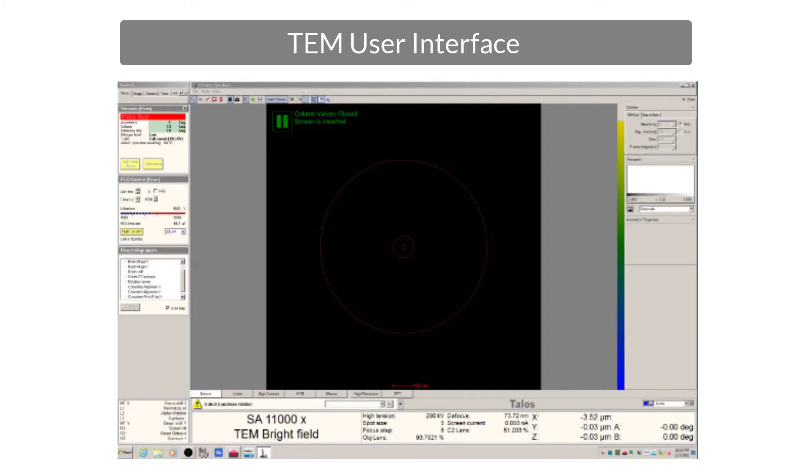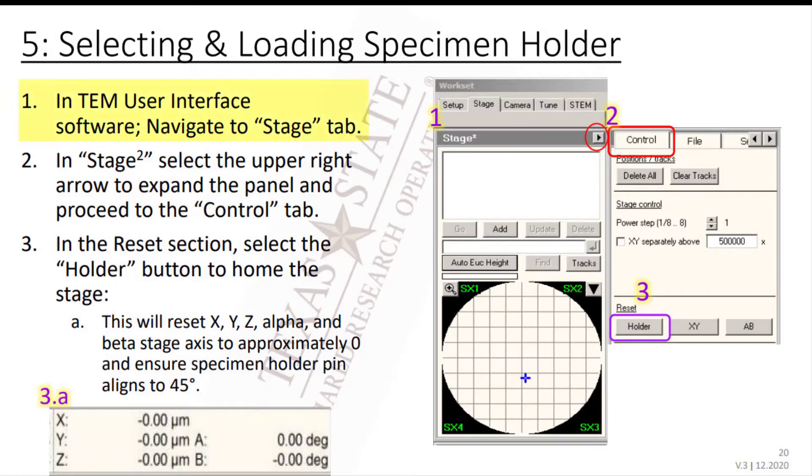To get started, in the User Interface, navigate to the Stage tab and select the upper right arrow to expand the panel. Proceed to the Control tab.